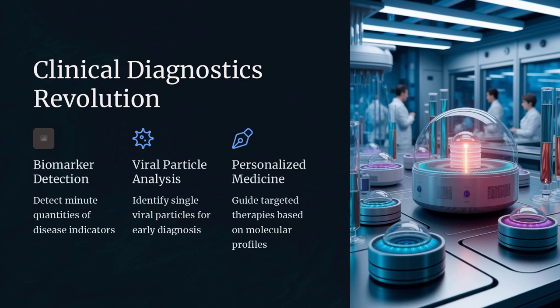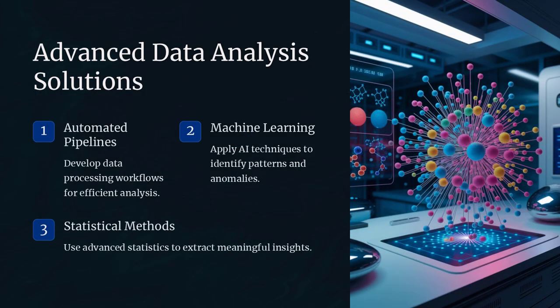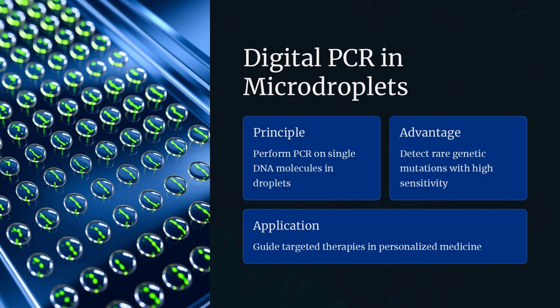In bulk experiments, the behavior of millions of molecules is averaged, which can obscure the presence of subpopulations with unique behaviors. Single molecule techniques, however, reveal the full distribution of molecular responses, capturing rare events such as transient intermediate states or variations in reaction rates that could be critical for understanding diseases or developing new drugs. For example, in drug discovery, identifying a rare conformational state of a protein that is the target of a new therapeutic agent might be crucial for designing more effective inhibitors. Single molecule analysis provides that level of detail, potentially leading to breakthroughs that would be impossible to achieve with bulk methods.